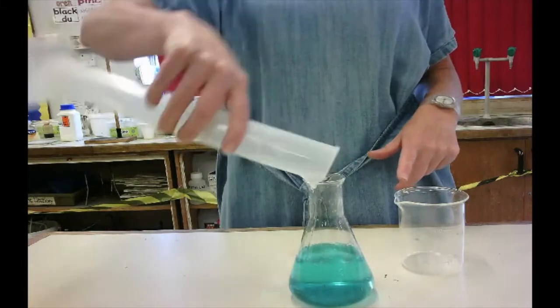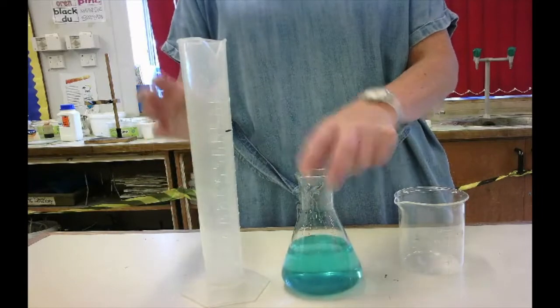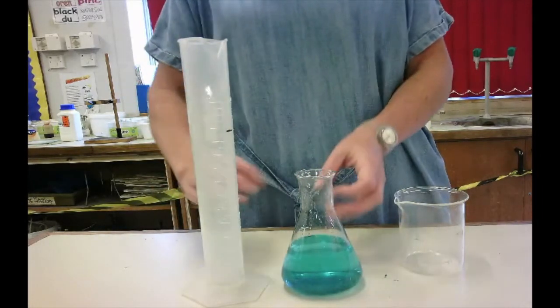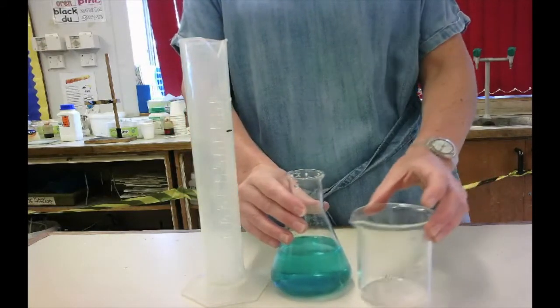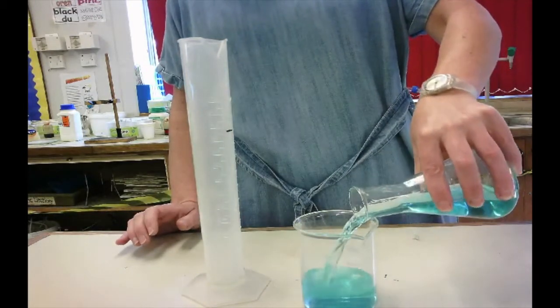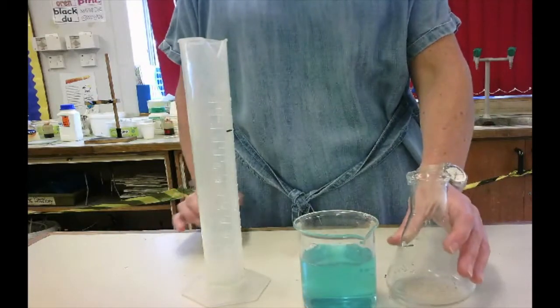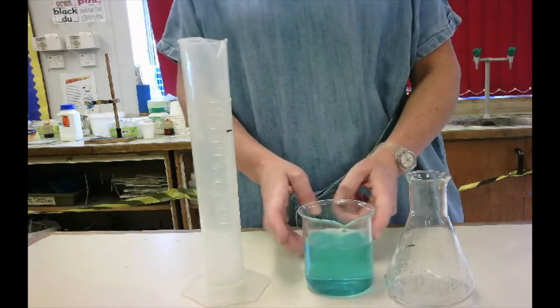So it's still 200 centimetre cubed, but think about what's changed. It's the same volume, but what's changed about the appearance of the liquid? And then I'm going to pour it into a beaker, still 200 centimetre cubed. What's changed again? The volume stays the same.